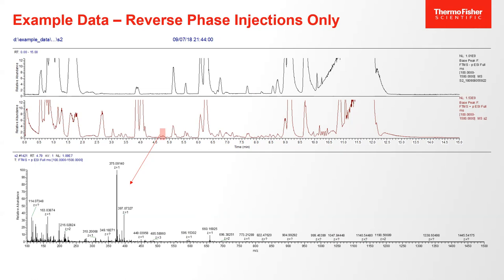Well, once you look at what looks like noise, there's still about 110 compounds that are in the noise alone. Okay. These peaks that look tiny produce beautiful LC peaks when plotted. Okay. Typically, I'm seeing about four orders of magnitude currently in data dependent on the Orbi that I can deal with.